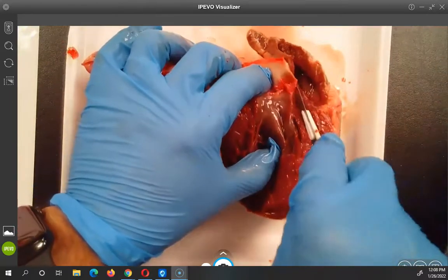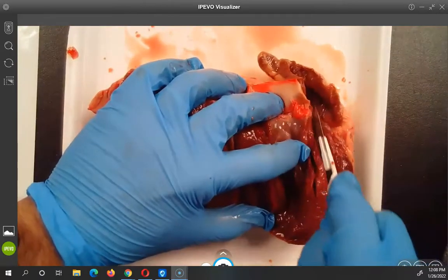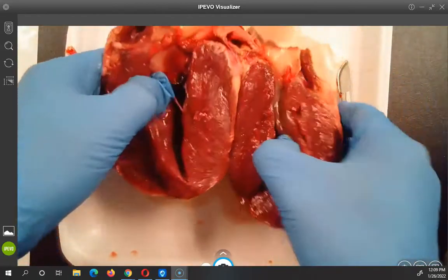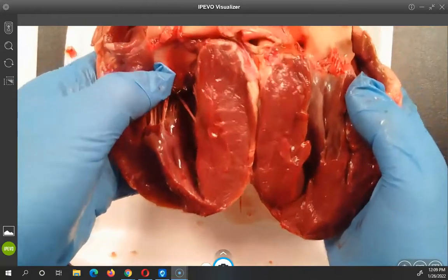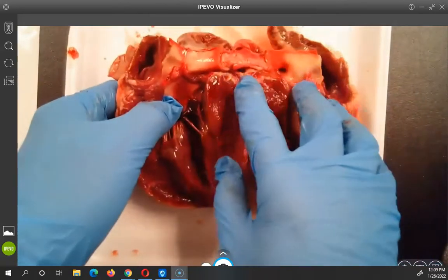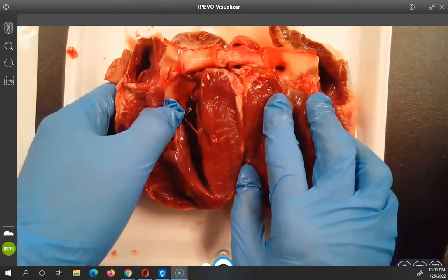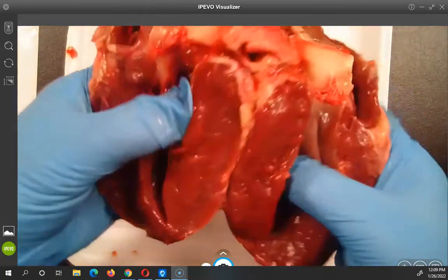This one is good — it's raw and it came from a good source. It came from a live pig not so long ago, which is not bad. So what you're noticing here is this is a lot of muscle. Think of what your heart does — from when you are born, this thing is beating. An average heartbeat is anywhere from 55 to 75 beats per minute. If you live a hundred years, think of how many minutes that is. This is a very strong muscle — it feels like a dense steak.